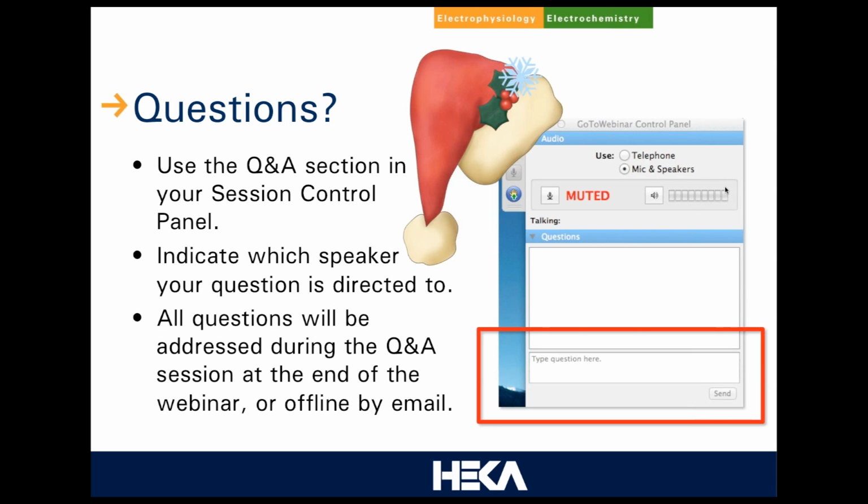So Telly, when you do whole cell patch clamp, the question essentially is, when is a good time to do the C-slow compensation and go to whole cell mode? And the second part of the question is, should that be done before switching from voltage clamp to current clamp? Yes, it should be done before switching to current clamp because it gives you some initial cell parameters. So when you switch, you now have a known good state. Otherwise, you have unknown values to start with. So it's always best to prepare your setup before you switch modes.